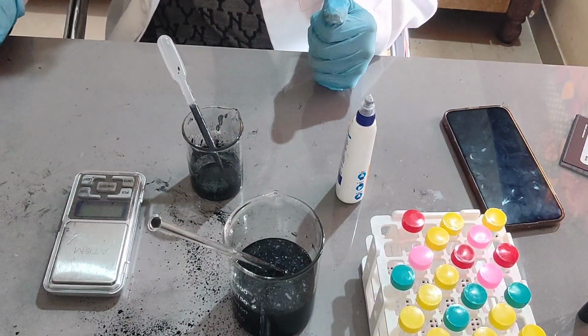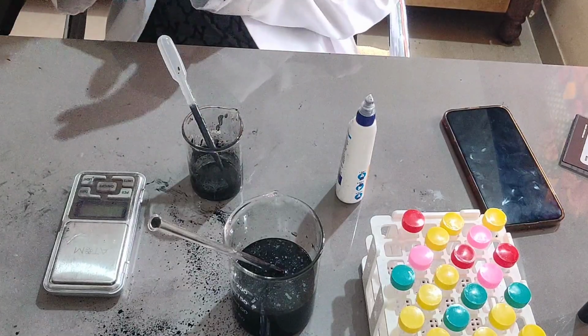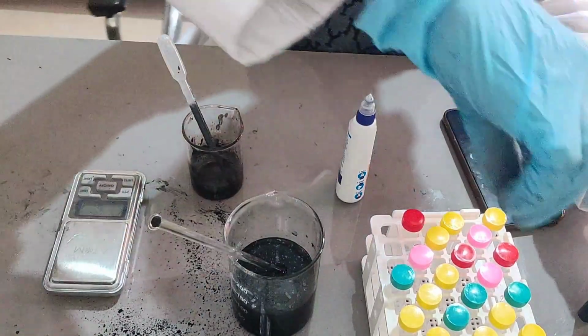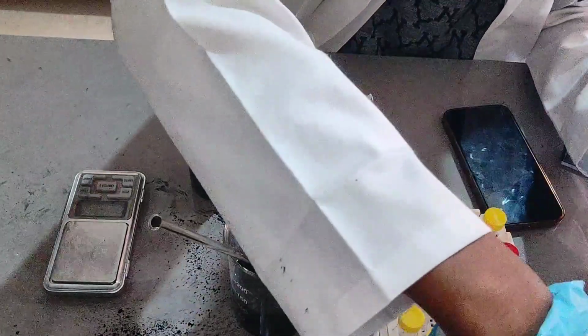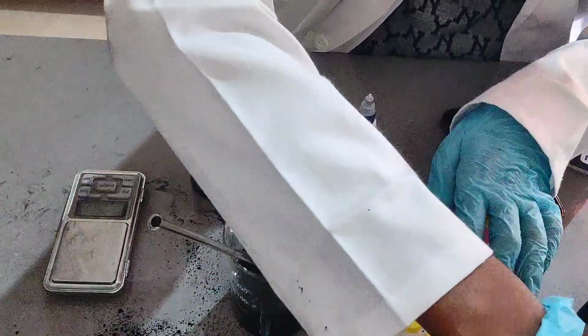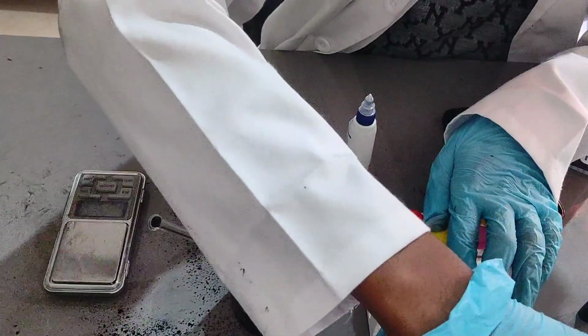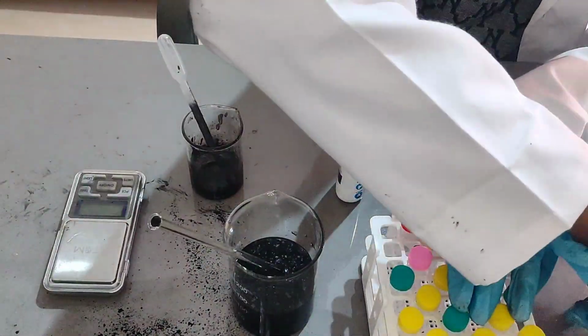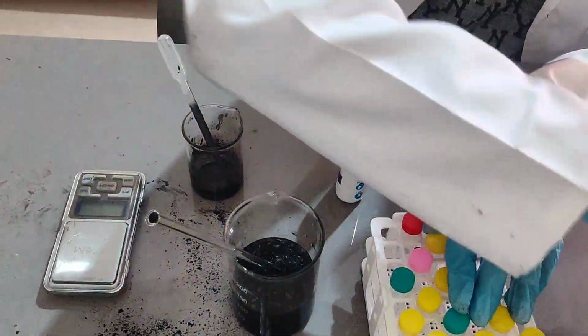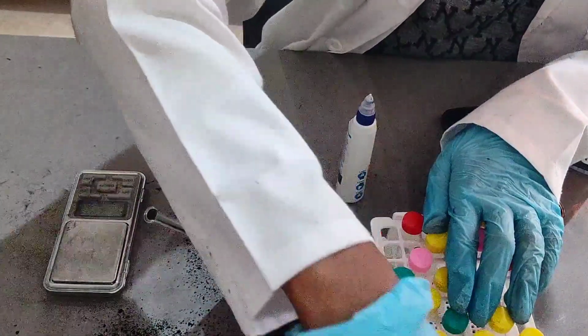So we are done with the samples. We created the samples, all good and done. I have to just put them in this rack and let them sit for a while, to see whether they fall out of suspension or not. And while it's doing that, we'll check why it falls out of suspension.